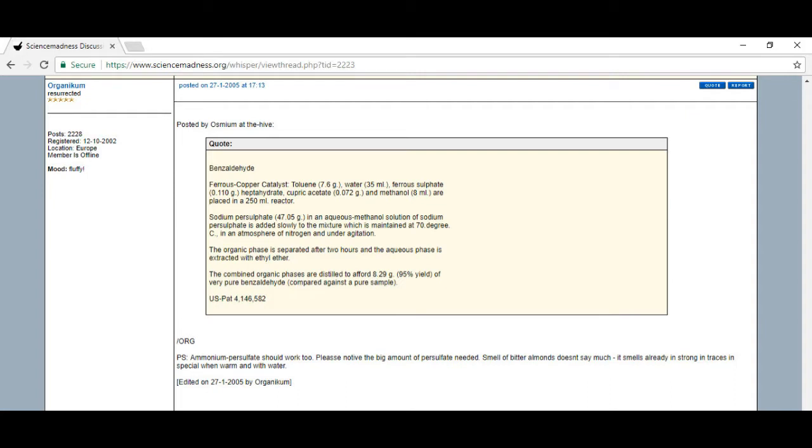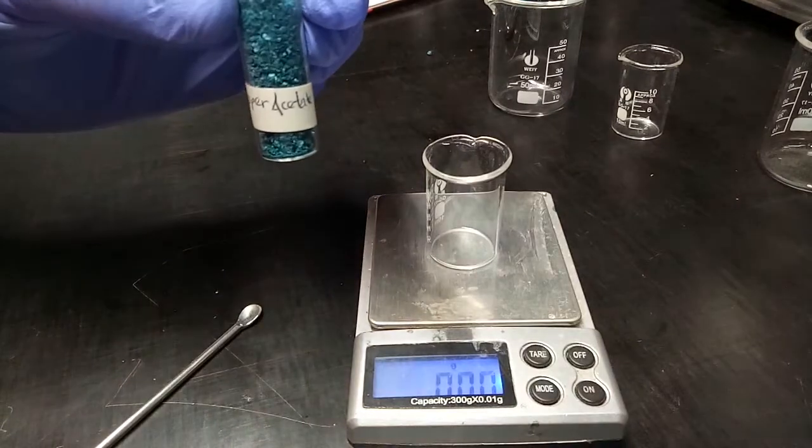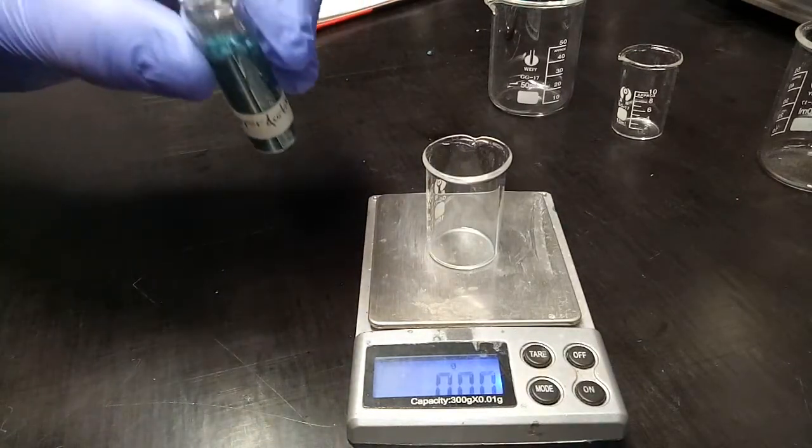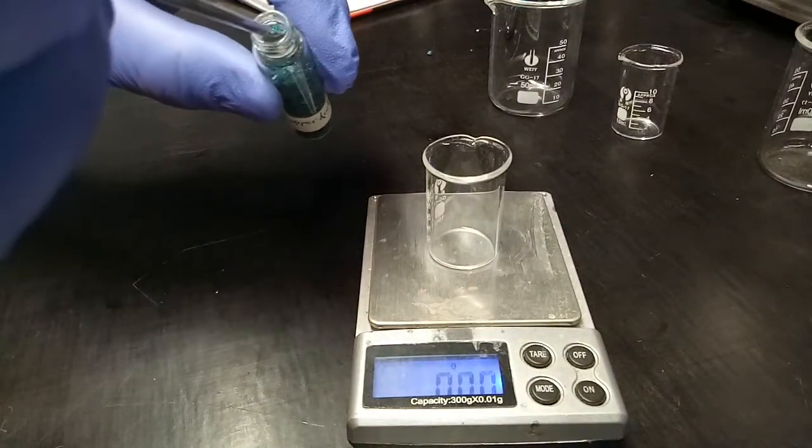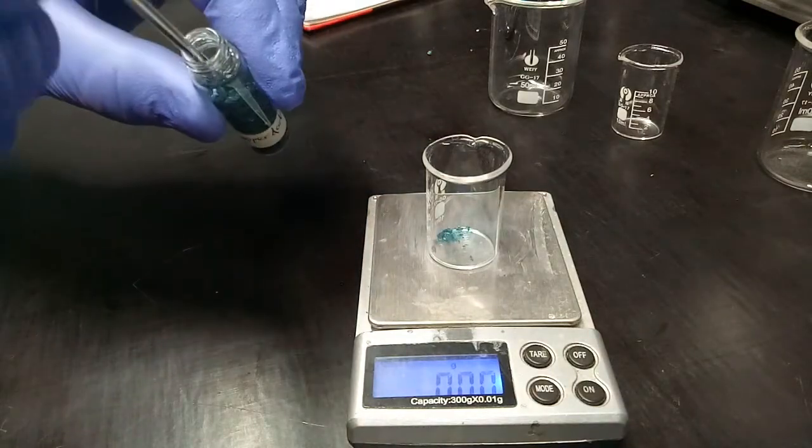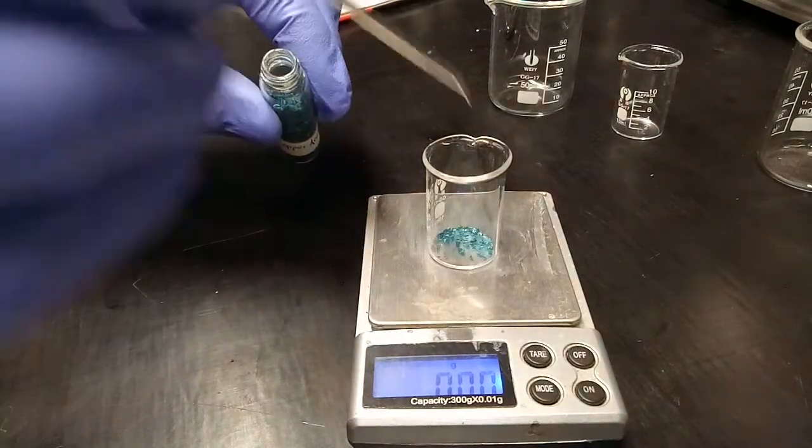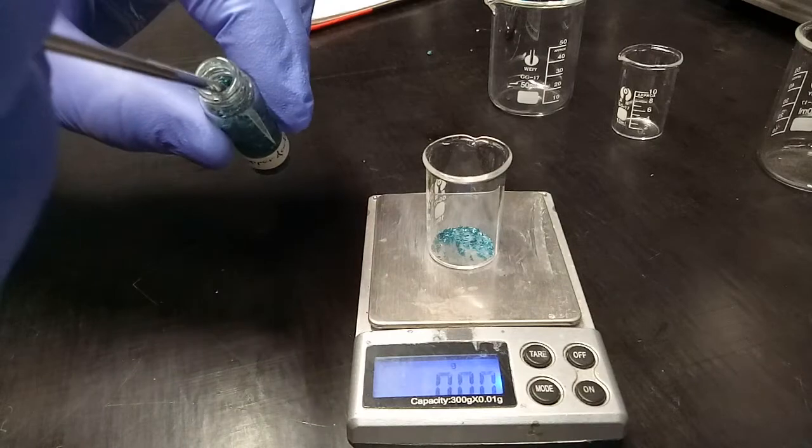I chose this procedure not because I actually need benzaldehyde, nor because I was after a great yield. In fact, this was a near failure, but rather this was a chance for me to practice some skills in the lab and also practice some skills with a handheld phone as a camera device.